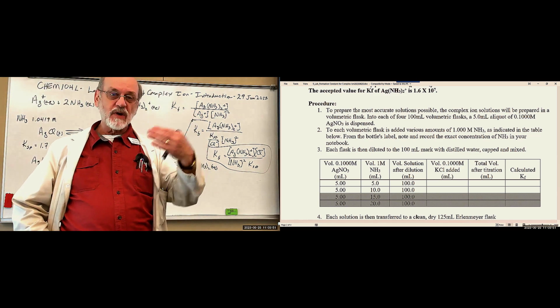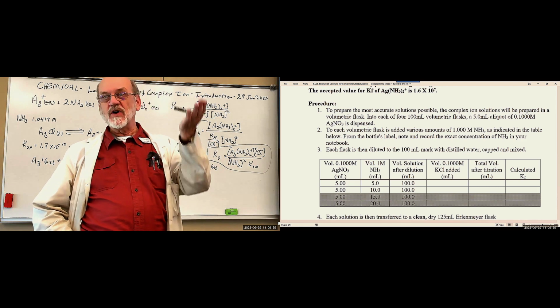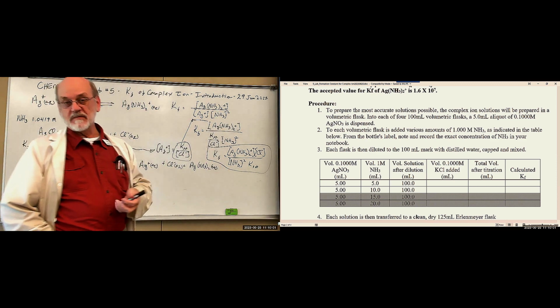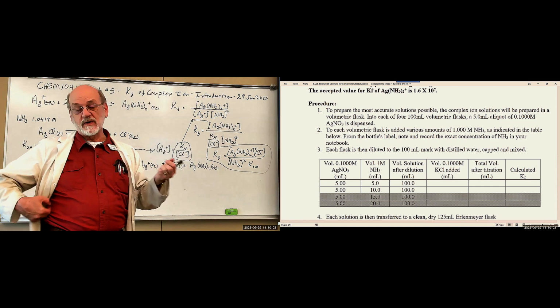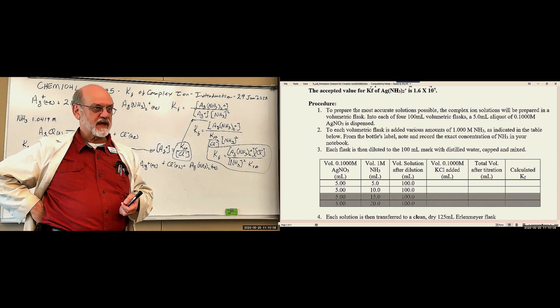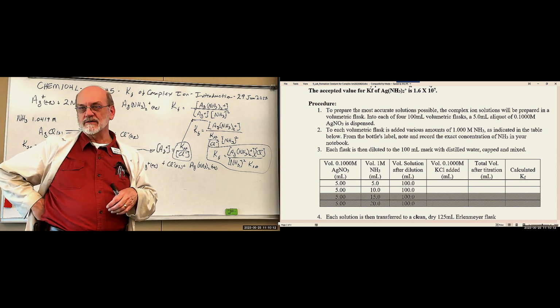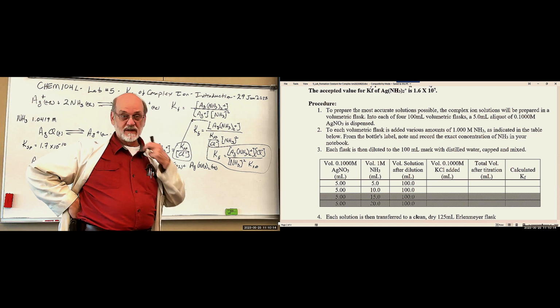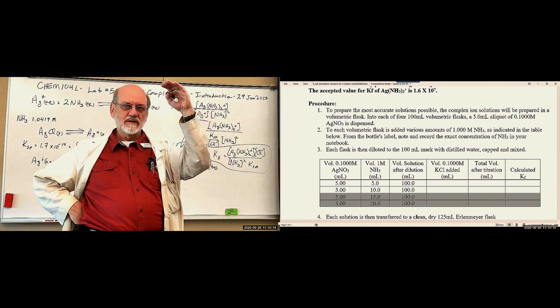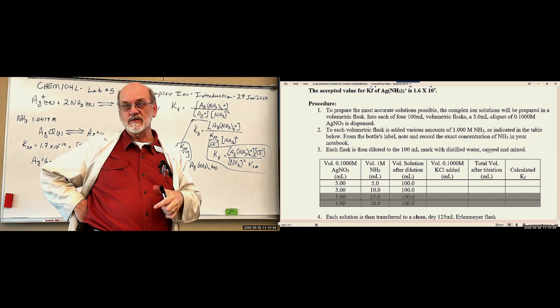As you increase the amount of ammonia, it takes more chloride to get that Q value up. So 15 might take 10 milliliters of KCl, and 20 might take 15 or 20 milliliters. But I think you can fill the burette up once, start at 0, and you can get less than 10 milliliters of your solution.